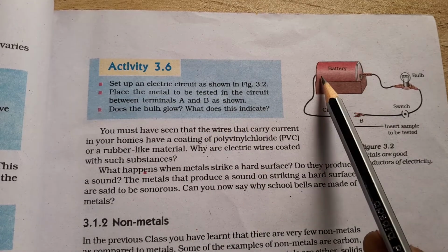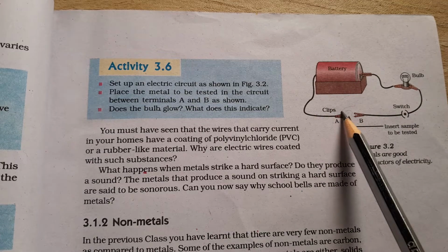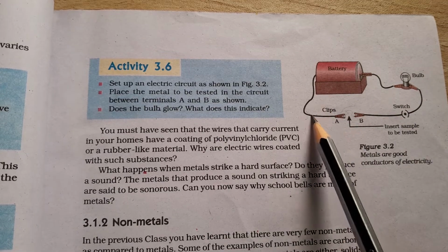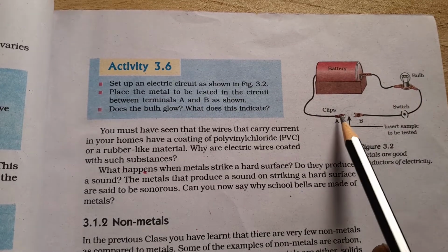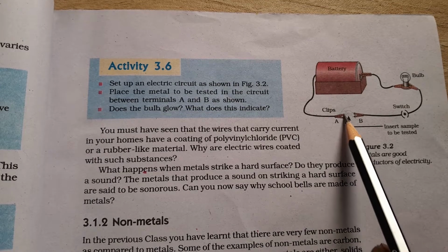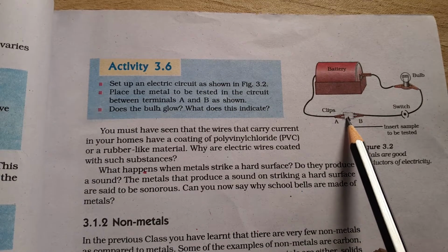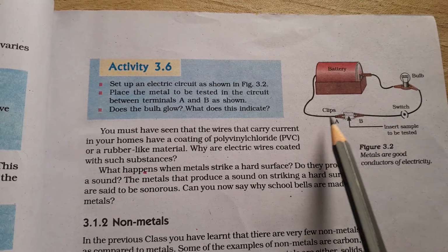So you are going to set up a circuit like this. The bulb is connected to the metal. If it is a continuous wire, when you switch on, the bulb will glow, okay. Now we are going to cut the wire and place a metal here. If it is a good conductor of electricity, then electricity will pass through this, right? So we'll check that, okay.